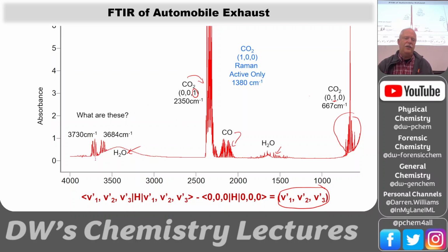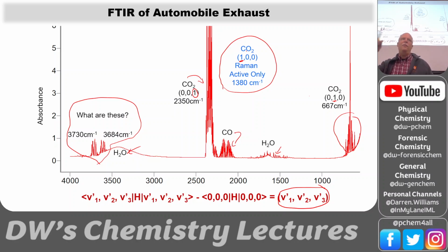And then we have these others, which we're going to talk about later. These are combination bands. And then we're missing a peak for CO2. It's Raman active only. Since CO2 is such a symmetric molecule, some modes are Raman active and other modes are vibrational or infrared active.